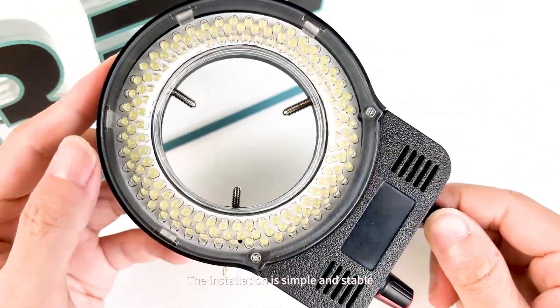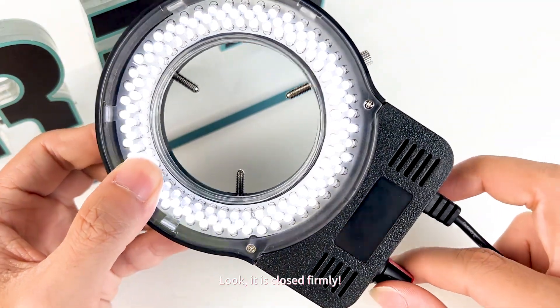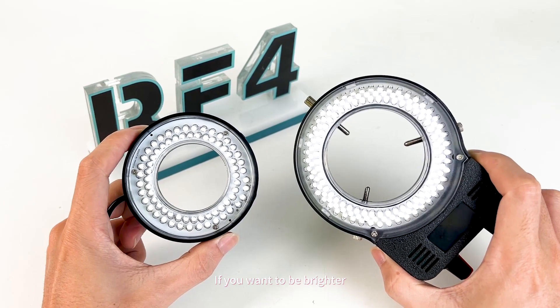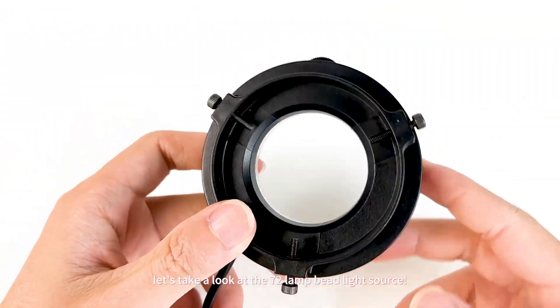The installation is simple and stable — the fixing screw can be twisted and it closes firmly. There is also a knob to adjust the brightness, which is simply synonymous with comfortable feel. If you want it brighter, you can get it as soon as you twist it.